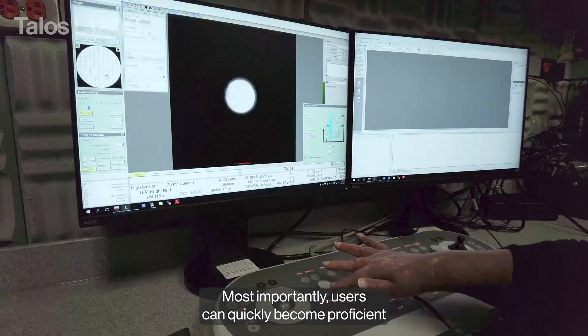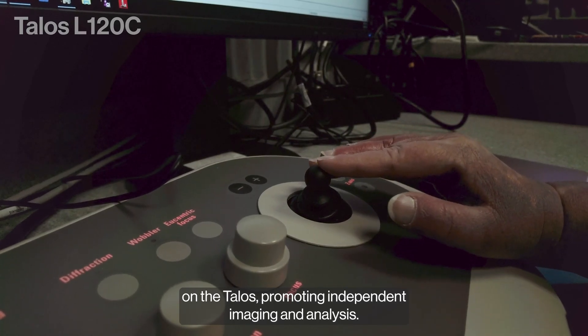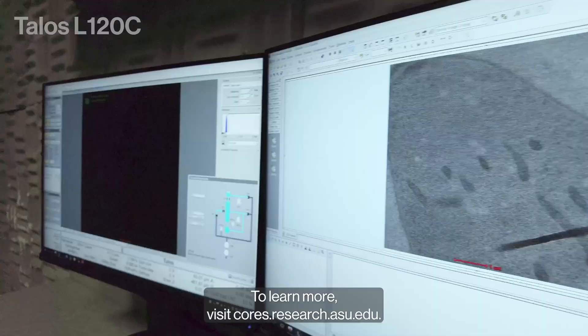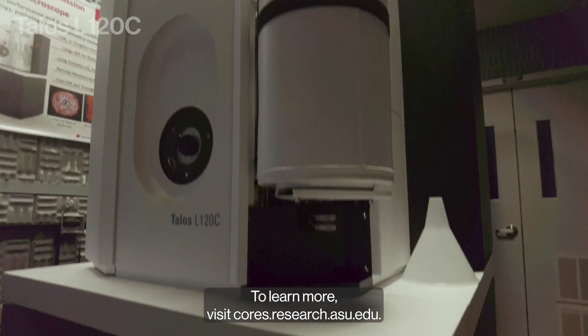Most importantly, users can quickly become proficient on the TALOS, promoting independent imaging and analysis. To learn more, visit cores.research.asu.edu.